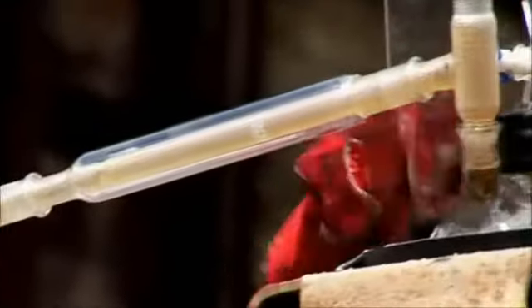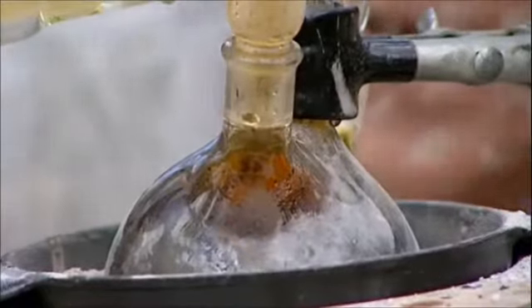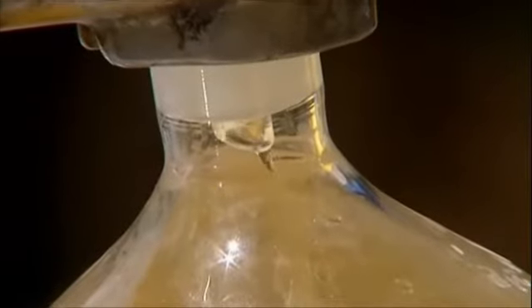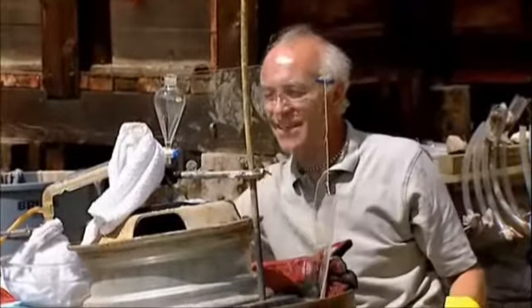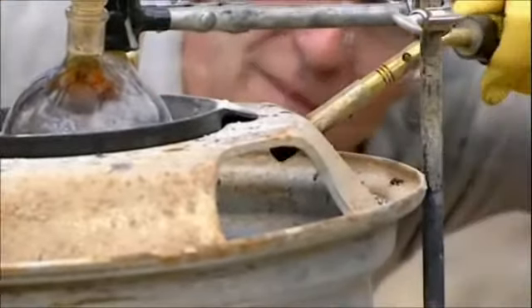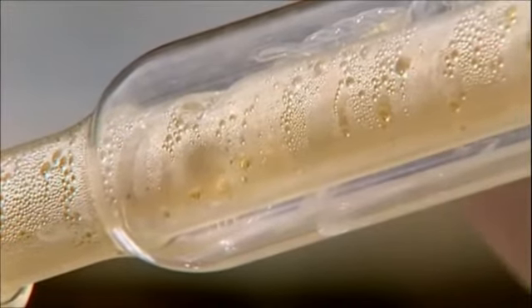Mike's on stage 2 of his chemical journey, making nitric acid by reacting his potassium nitrate with homemade sulfuric acid. A few flames and fumes later, success! This kind of apparatus and setup just excites the hell out of me. Makes me feel like Merlin. Mike's hoping that this nitric acid will react with Hermione's silver ore to make the silver nitrate they desperately need.